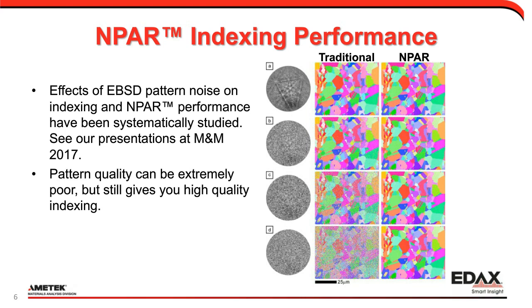We have dived pretty deep into understanding the performance of this and the effects it has on your data. I'm going to touch a little bit on that at the end, but I highly suggest you see our presentations at M&M, where we go in depth on a lot of this on the scientific side, looking at what is changing, how it is changing, and, in the end, what this affects in your data.